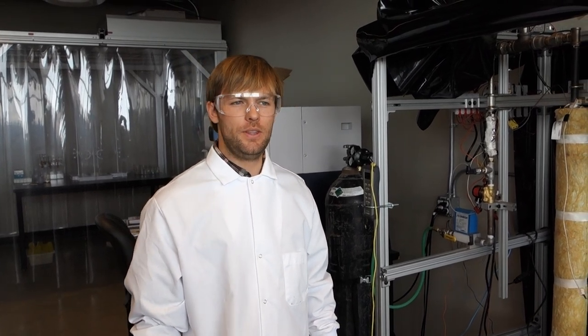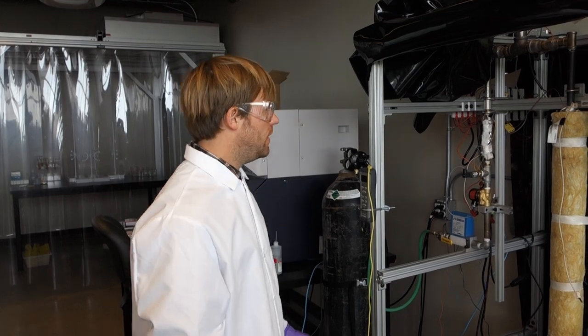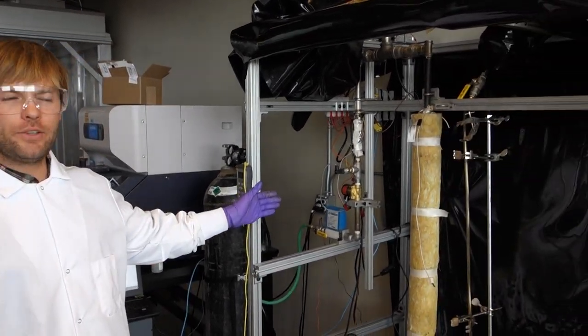Hello, my name is Sam Hansen. I'm a graduate research student here at the University of Idaho in the Center for Advanced Energy Studies. This is our pyrolysis reactor.